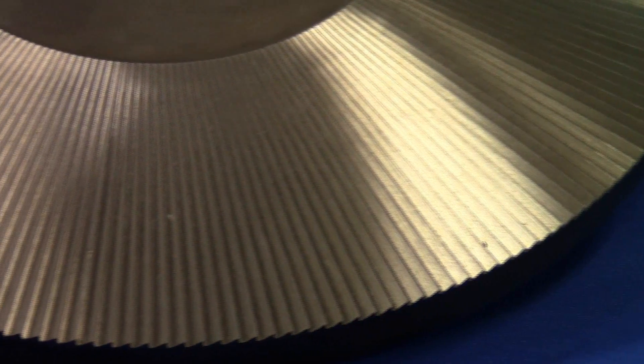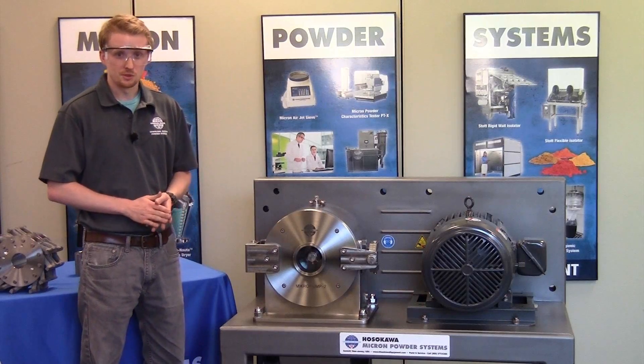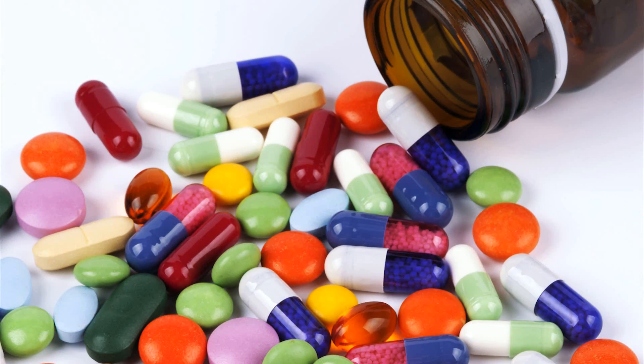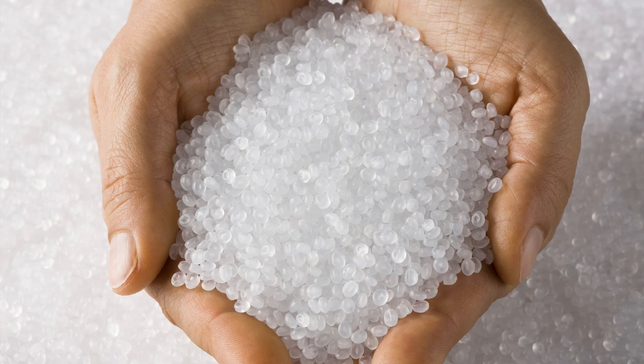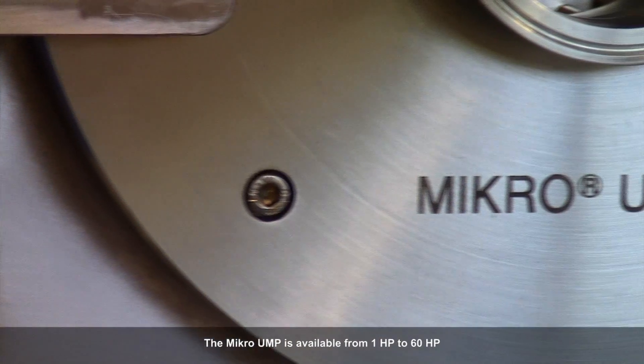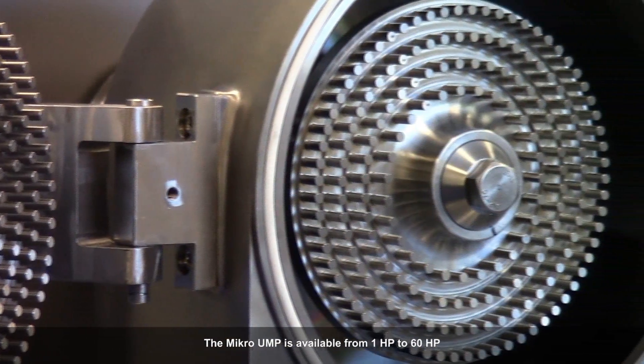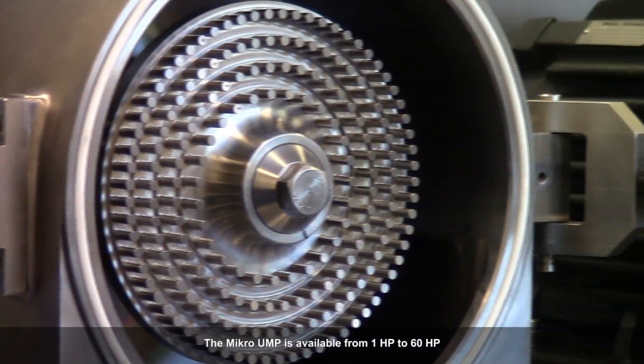And the attrition mill system. The Micro UMP2 has been specifically designed for the food and pharmaceutical industry because of its easy to clean nature. However, it's also capable of milling chemicals and polymeric substances. The Micro UMP2 is capable of coarse granulation down to ultra-fine grinding with a top size of approximately 35 microns.